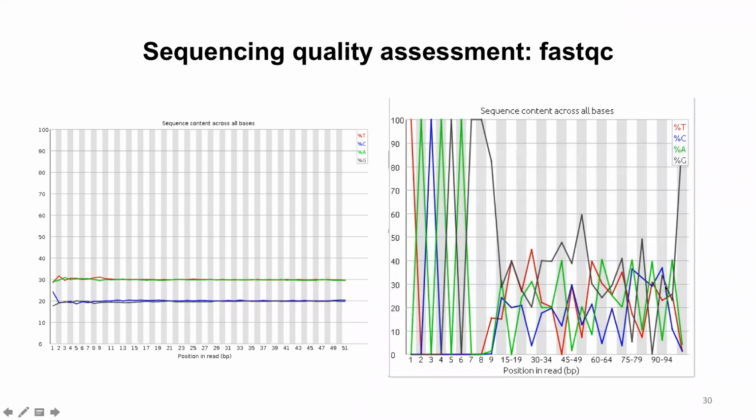Yeah, that looks like a barcode, right? Yeah, it looks like a barcode or some adapter sequences. Yeah, we do the same thing as in the previous one, which is essentially ignore the FastQC and align to a genome. I just wanted to see if that was the correct way, or the way people typically do it. Yeah, so once we see it, certainly there's no way that this barcode or adapter sequence can map to the genome. We'll have to either trim or redo the experiment.